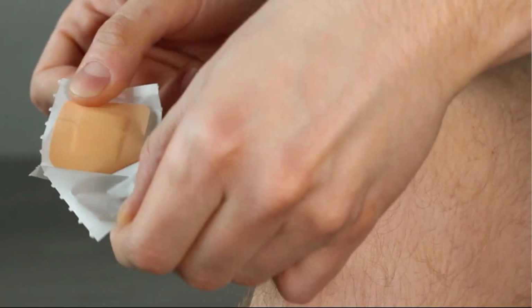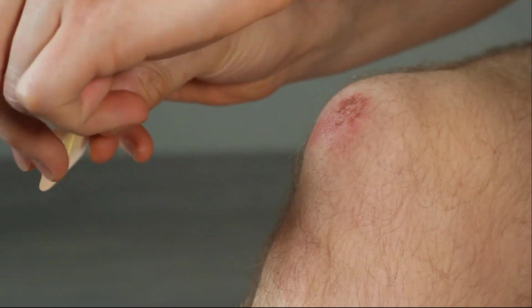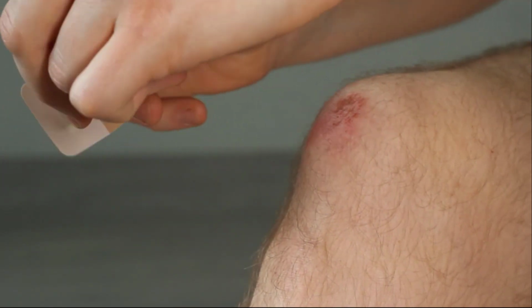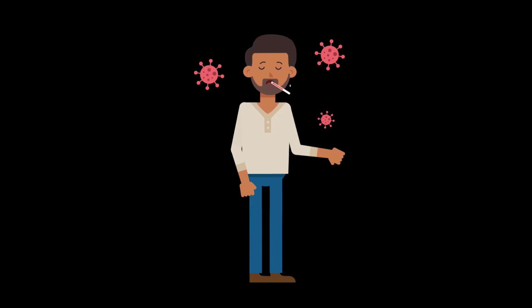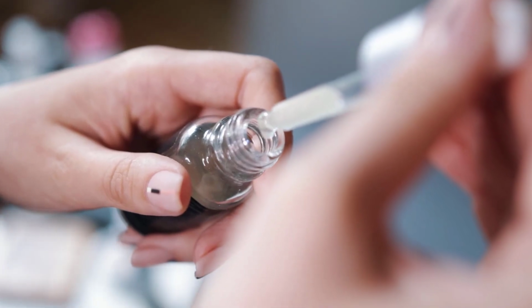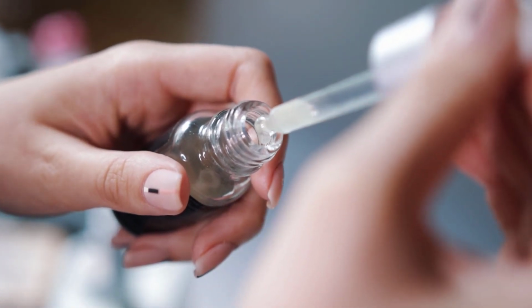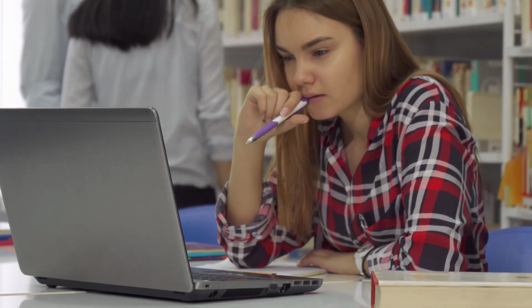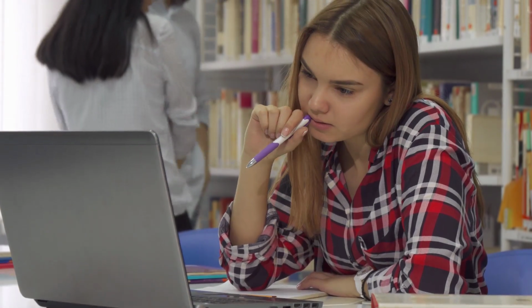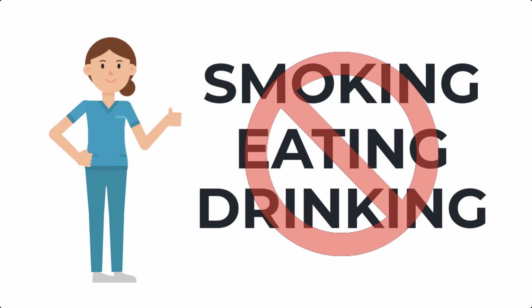Any student with a fresh, unhealed cut, scratch, or burn should notify the instructor before beginning or continuing laboratory work. If you have a personal health problem or are in doubt about participating in a laboratory session, check with the instructor before beginning. And remember, careful attention to principles of safety is required throughout any laboratory course in microbiology. Keep fingers, pencils, and other objects out of the mouth. Do not smoke, eat, or drink while in the laboratory.